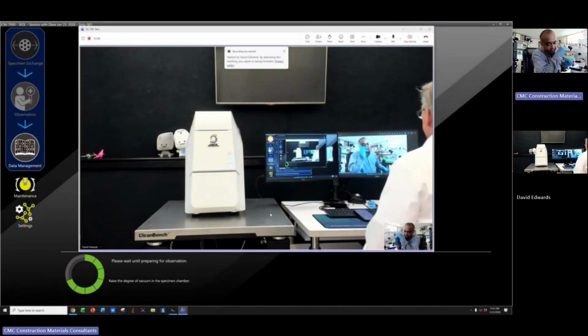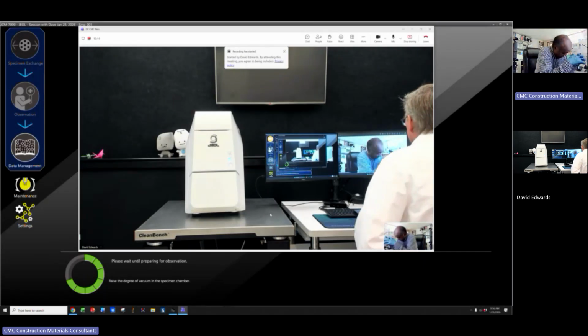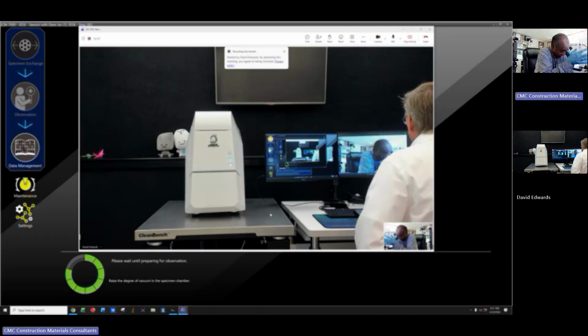Actually, I'll tell you what, my second problem is many times when I don't use my SEM for like a week, when I start, I don't get any live analysis. The live analysis screen is completely blank. But if I do the shutdown of the SEM only, just the power button, then it comes back.